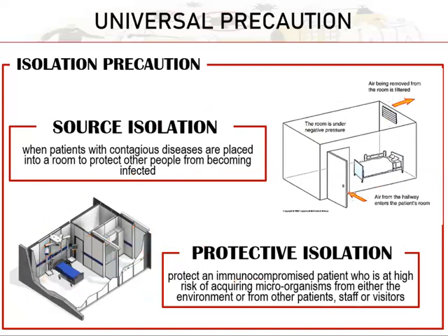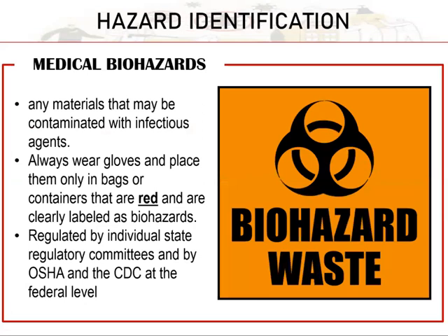So that is isolation precautions. Okay. The next one is medical biohazards. So we already know this one. Most of our waste materials in the laboratory are completely infectious. So this sign is very important so that those who dispose of it, or the trucks collecting the garbage, know that these wastes are highly infectious, and they must separate it from the regular household waste.